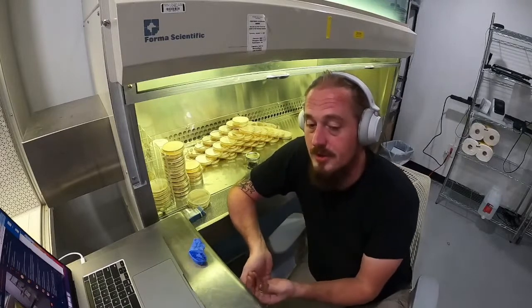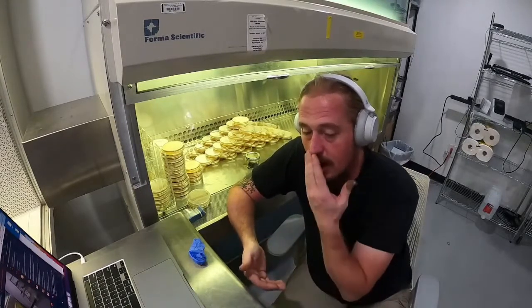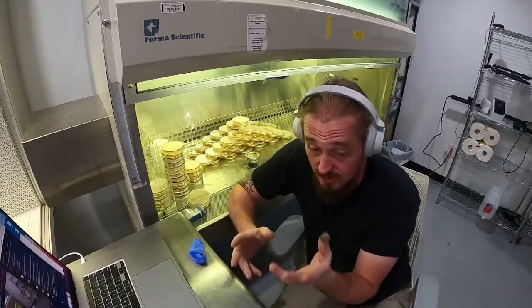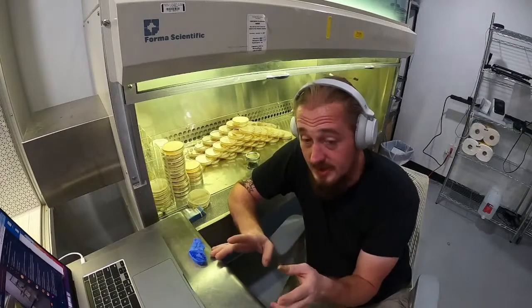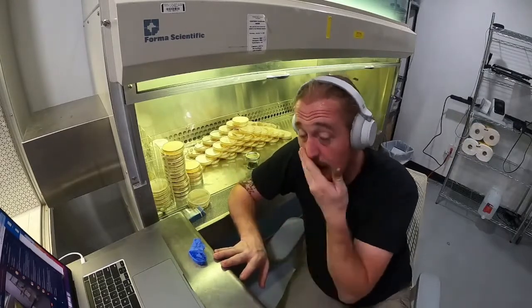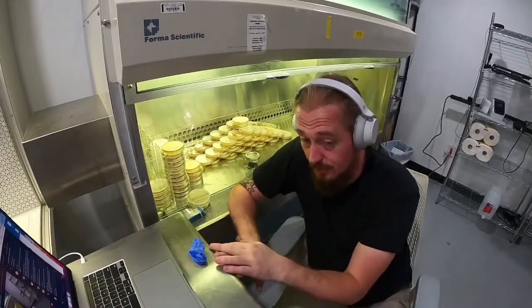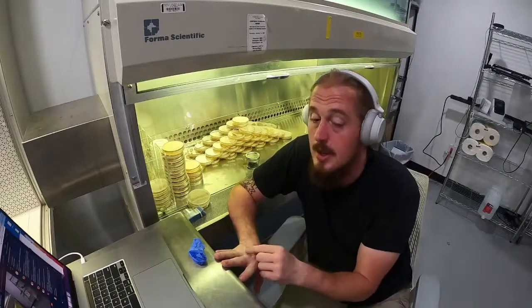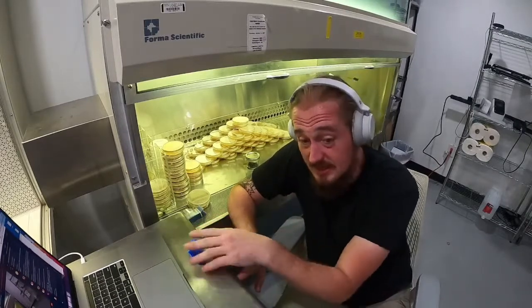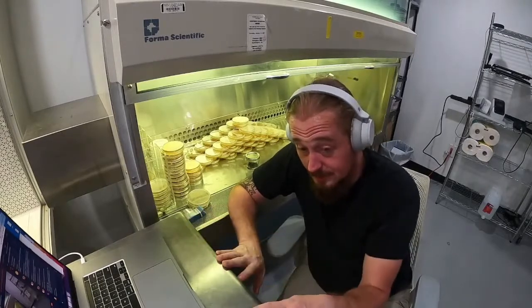So what you really want to do is maximize your pin set. You want to have early pin set. Basically, you want to put your tub in the dark and let it colonize. During that colonization, you can cover up those filter ports and let the CO2 increase, right? You don't want to completely block those filter ports because you need some oxygen, but the more you restrict it, the higher the CO2. Fungi like lots of CO2 to increase their pin set coverage, right?